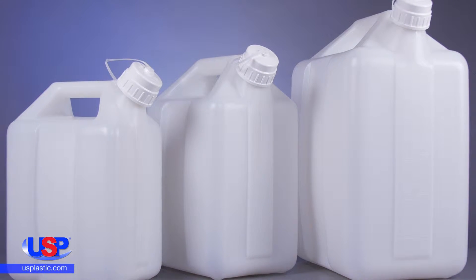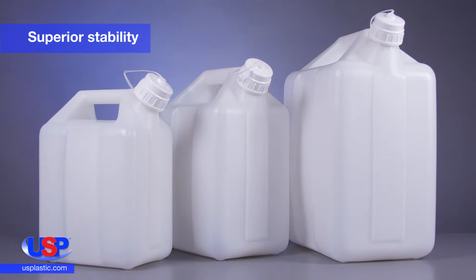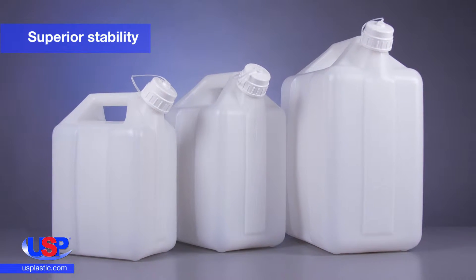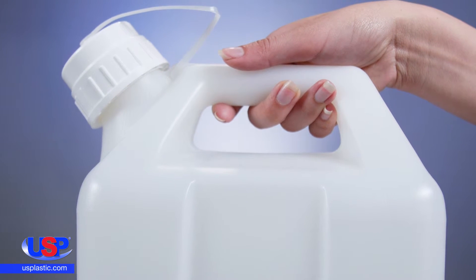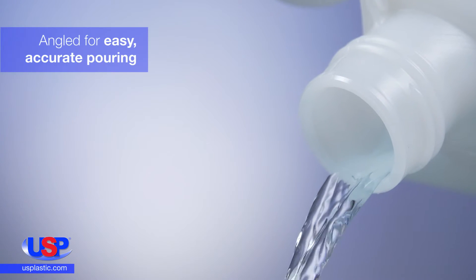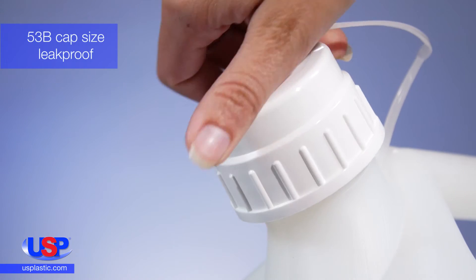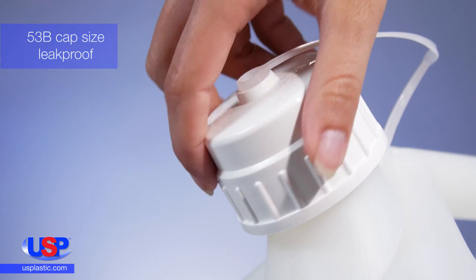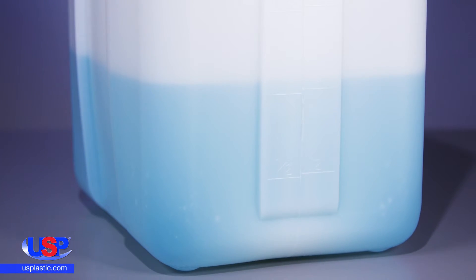Our Thermo Scientific Nalgene HDPE jerry can offers superior stability with its wide stance and low center of gravity. Its molded-in handle and recessed bottom provides a sturdy grip when lifting. The integral spout is angled for easy, accurate pouring and includes a tethered polypropylene closure to prevent loss. The jerry can is graduated in liters and gallons for easy measurement, and its rectangular shape optimizes storage space.